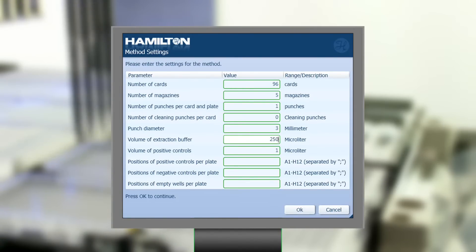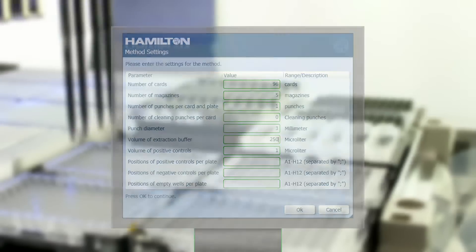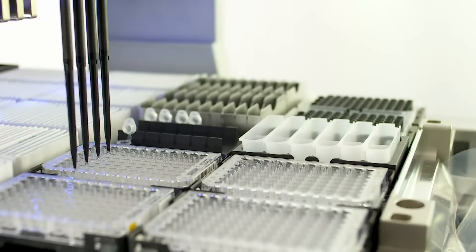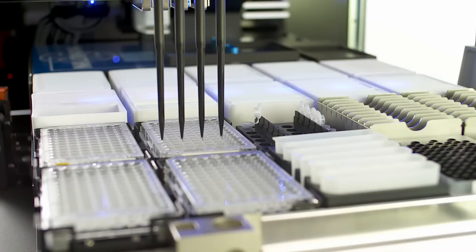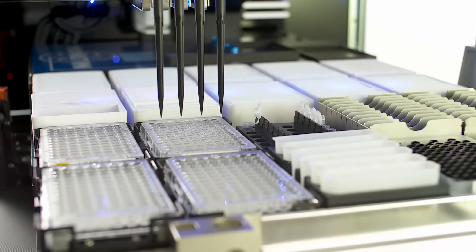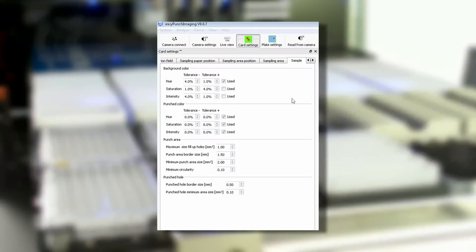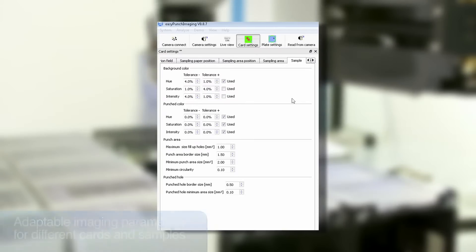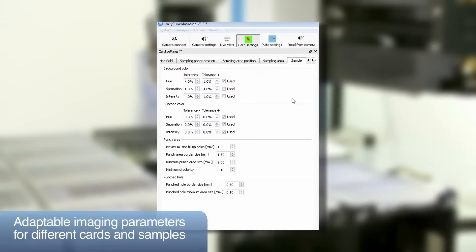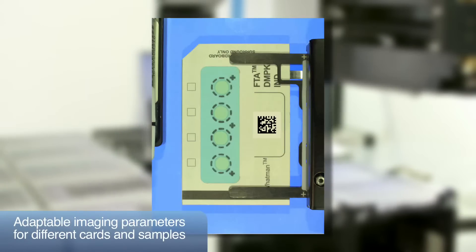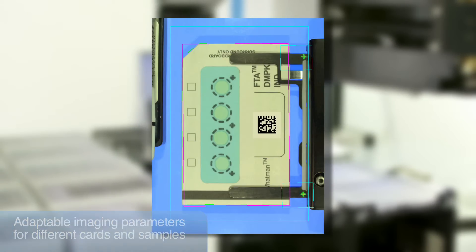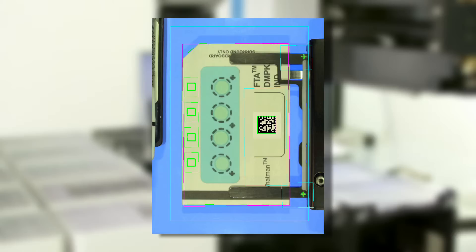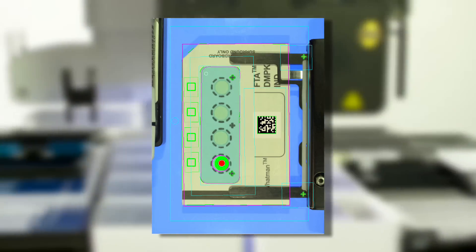If necessary, even the whole workflow in the software can be tailored to your needs. Individual parameter settings can be used for different card and sample types. For example, plasma spots on blue indicating cards can be detected using different imaging parameters. This allows complete freedom in the choice of your sample.